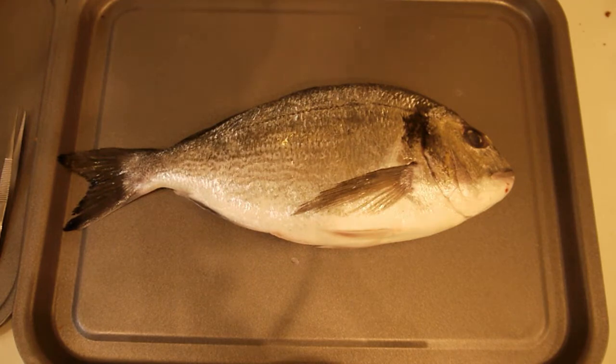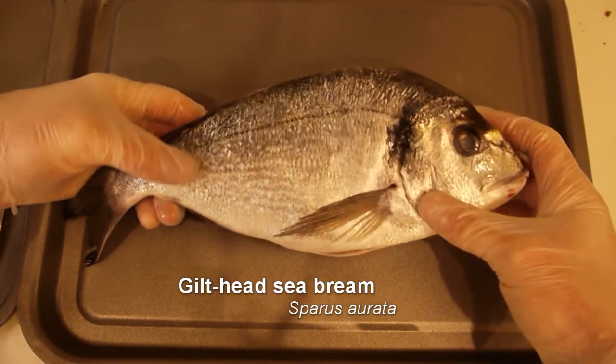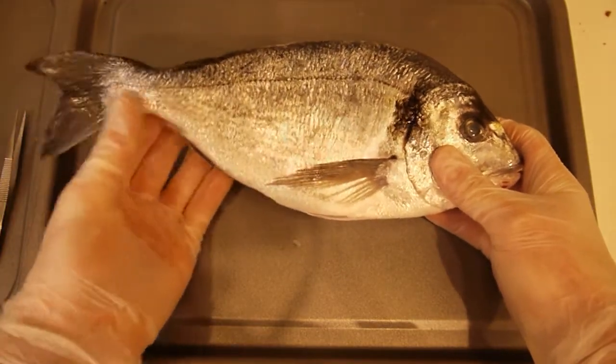Hello, you're watching Bones and Stones, and what I have for you today is this gilt-headed sea bream. It's the only species of sea bream in widespread farming, and this one I got from the fishmonger. I'm going to dissect it for you, then cook and eat it.